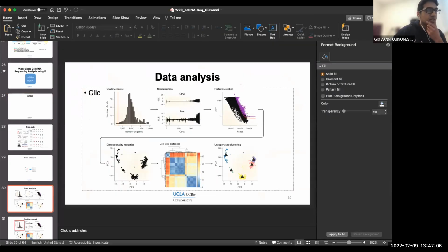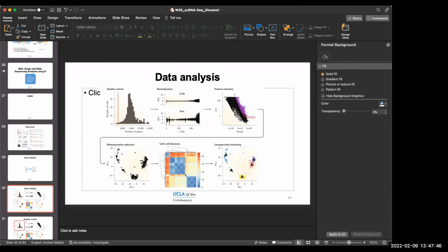So can we do a show of hands? See how many people have RStudio or another R platform already installed. Okay, I'm hoping it will be everybody. We have at least a majority.